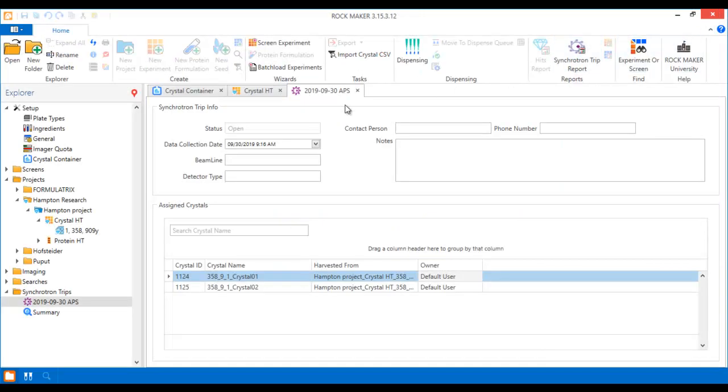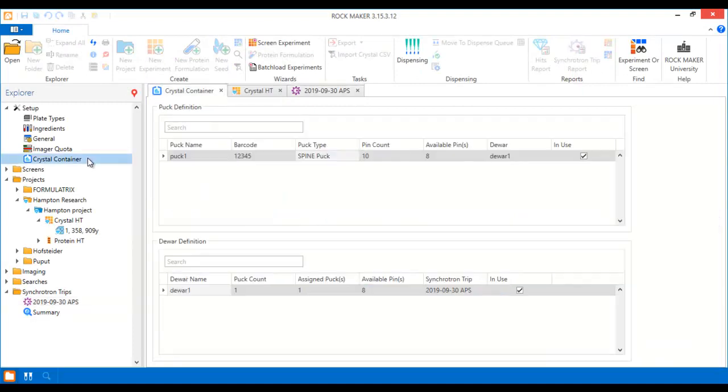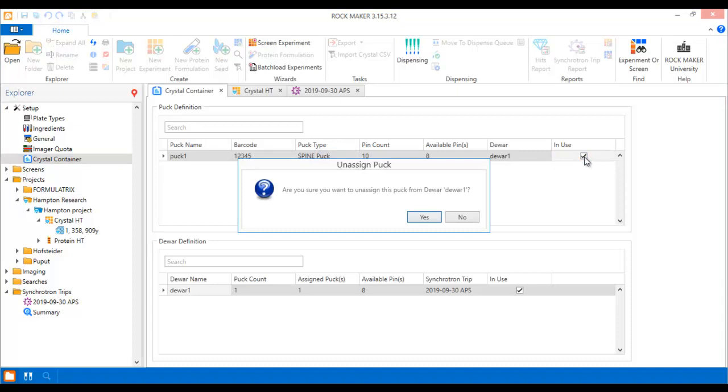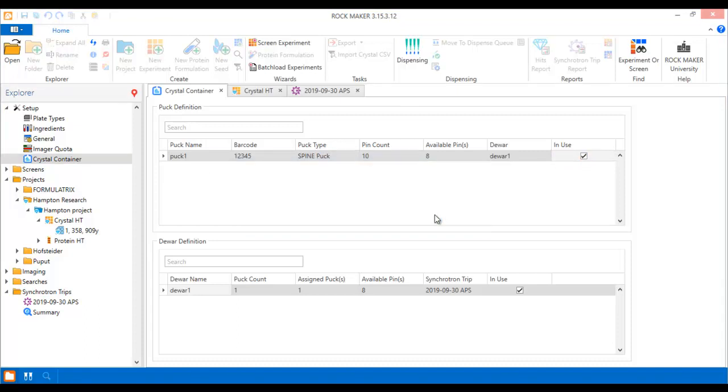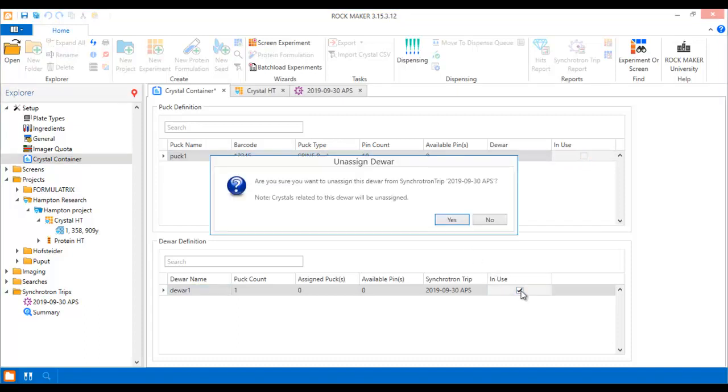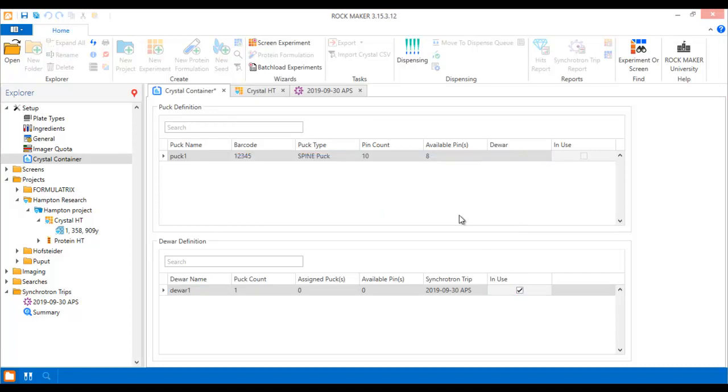And when you're ready to plan your next synchrotron trip, make sure you clear the in-use checkboxes next to your pucks and doers so that you can reuse them. With Synchrotron Trip Management in RockMaker, you'll be able to keep complete records of your synchrotron trips, allowing you to track your crystals every step of the way.